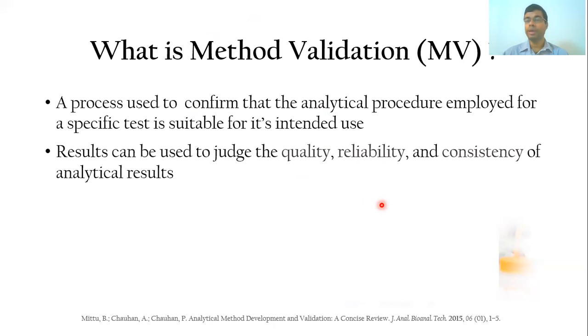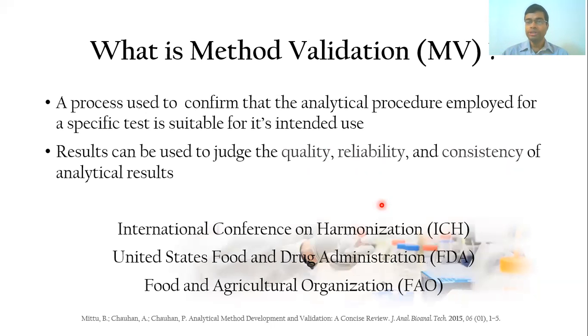Once we develop that procedure, it should provide continuously reliable and consistent results, regardless of where you do this test, regardless of the laboratory, regardless of the person who is conducting this analytical procedure. To oversee that, there are several organizations which come up with different rules.